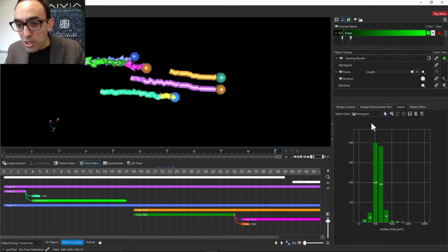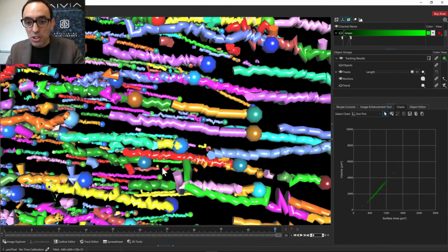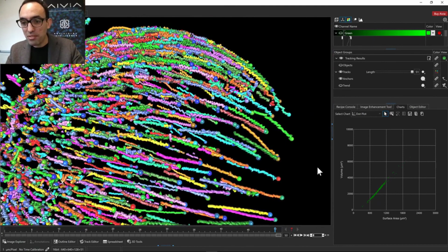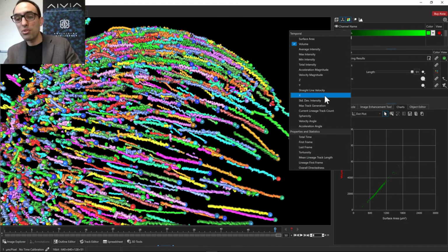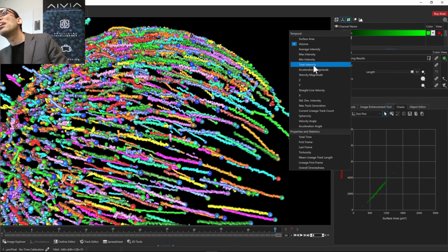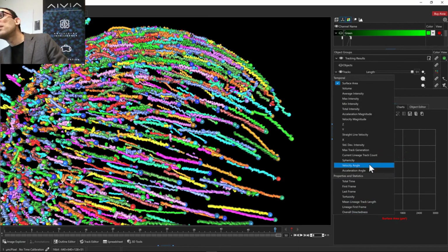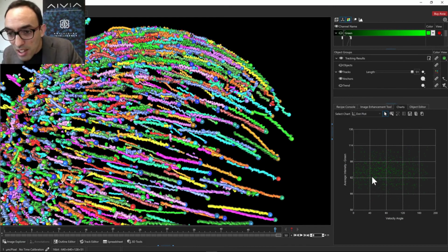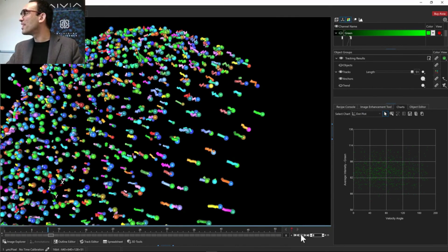So final thing I wanted to show is the scatter plots, together with the data that we have. So we have this, and you can plot any parameter of interest. I have a difficulty seeing actually. Let me see. Okay, maybe average intensity versus, yeah, so it doesn't show, it's too small, right?